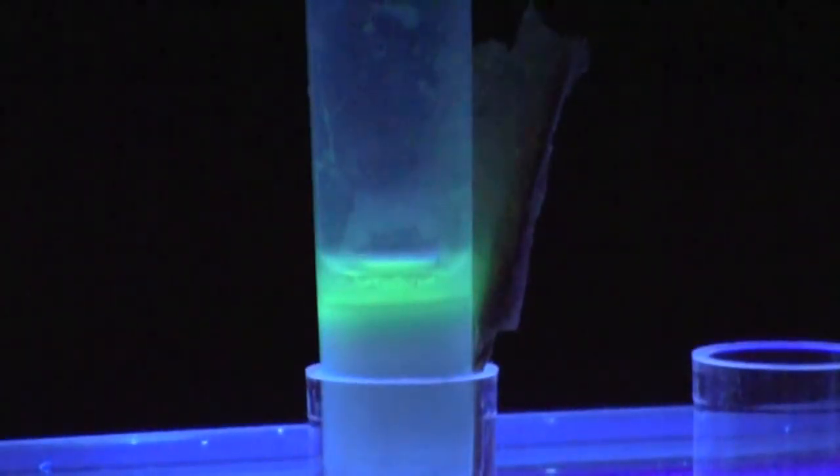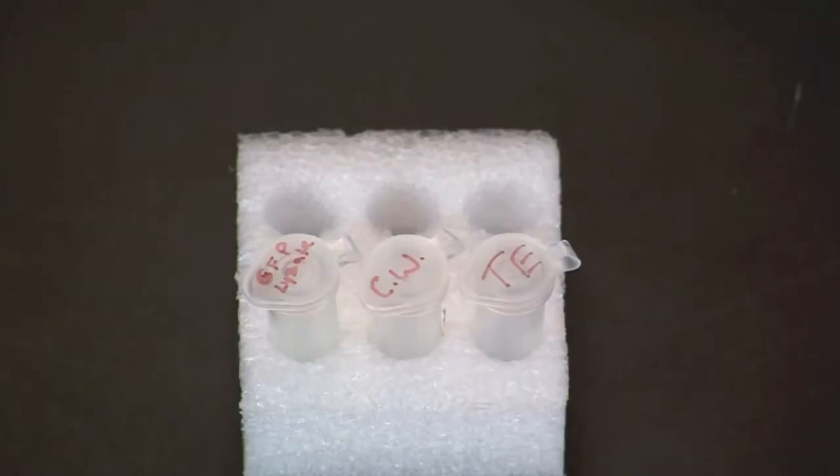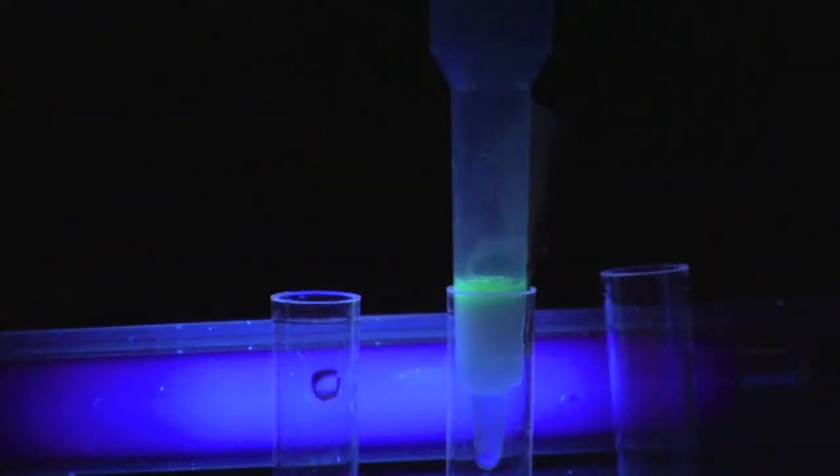Allow the lysate to enter the column bed until the meniscus is within 1 to 2 millimeters of the surface of the resin. Next, add 250 microliters of column wash buffer. Wash buffer is a medium salt solution.